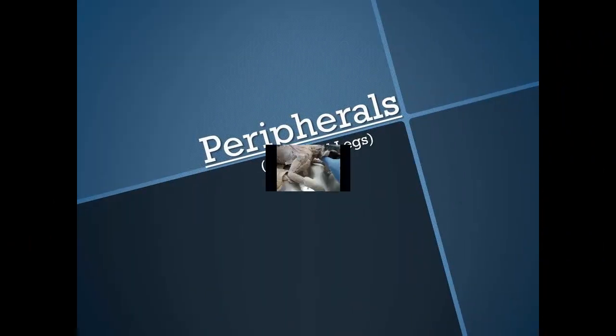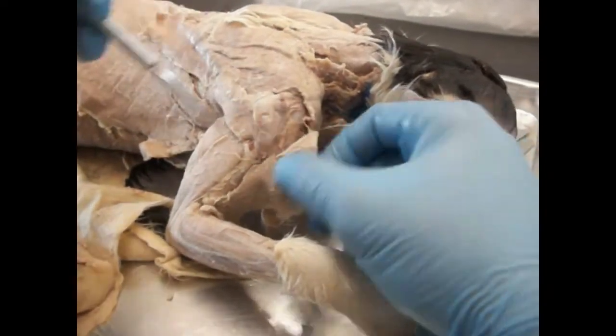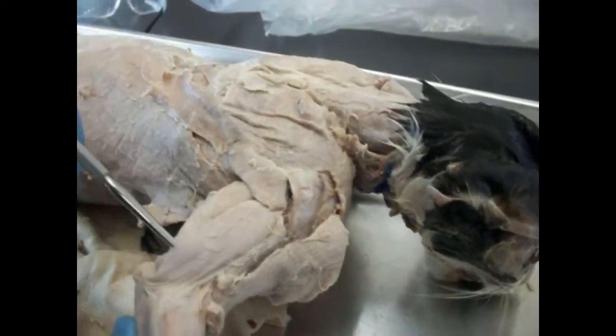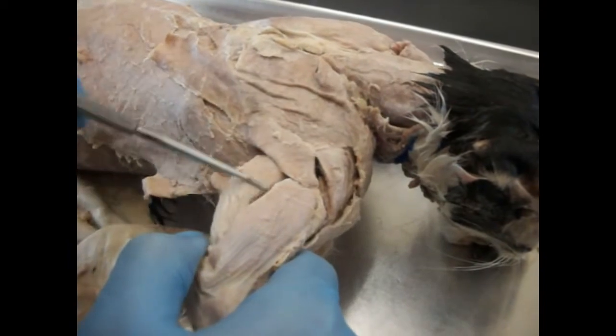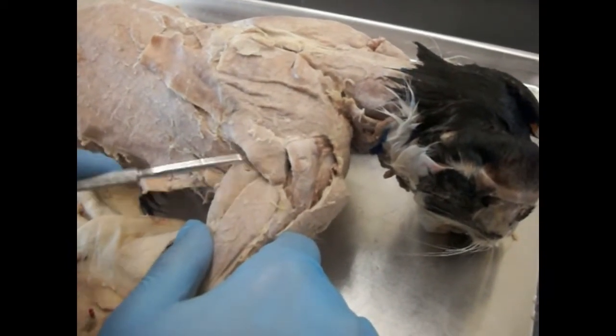As you can see, the first muscle I'm touching is called the acromiodeltoid, following the clavodeltoid. Above the clavodeltoid is the clavotrapezius. Right now when I am moving my probe up and down, that muscle is called the lateral head of the triceps brachii. Beneath that muscle is the long head of triceps brachii. And last but not least is the spinodeltoid.